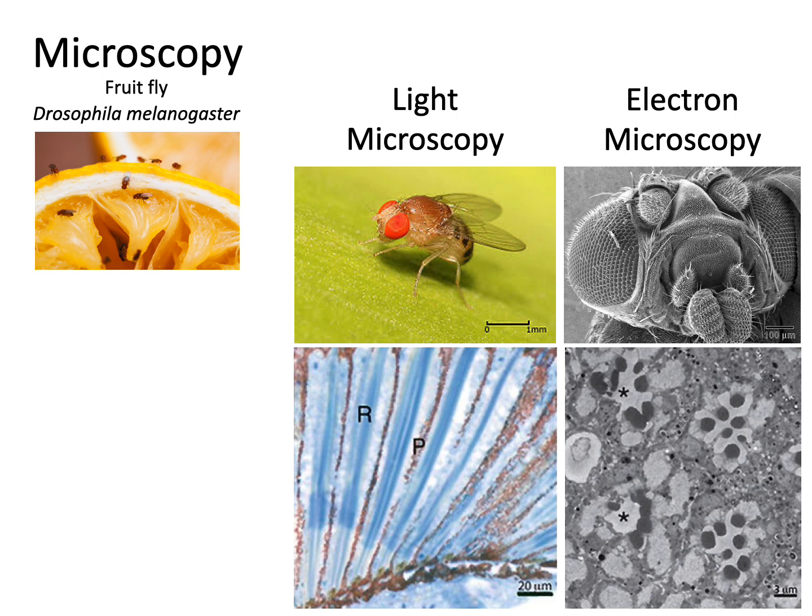So we've got to understand how these small animals and their even smaller organs and their even smaller cells and proteins are behaving in the paradigm of some sort of a study, what kind of changes are being impacted by variables and that type of thing. So we need help to see these little beasts and their organs and cells, right? So this is where we can use microscopy.